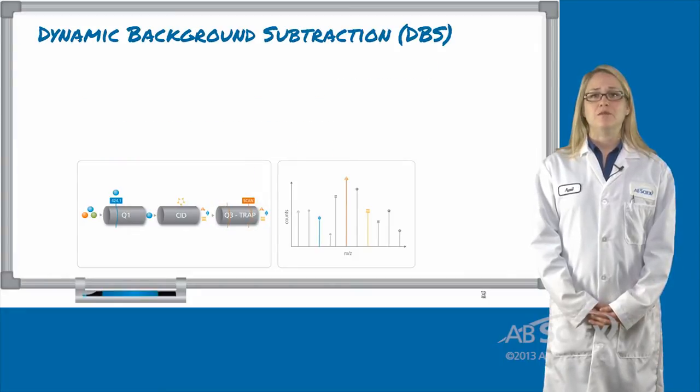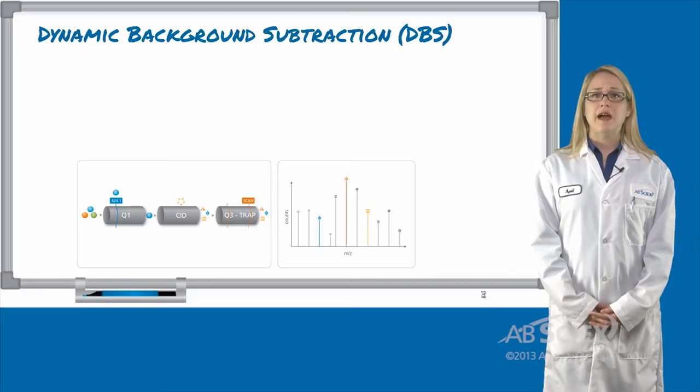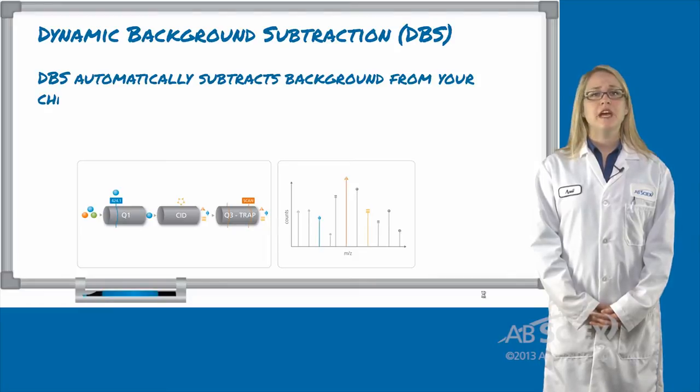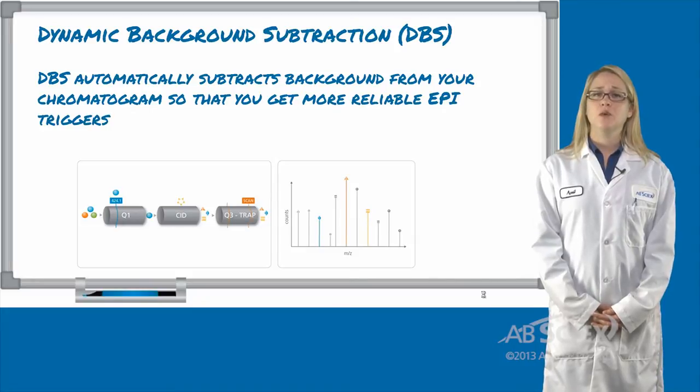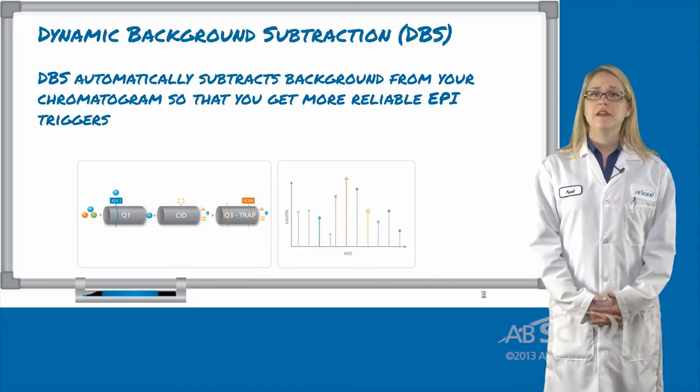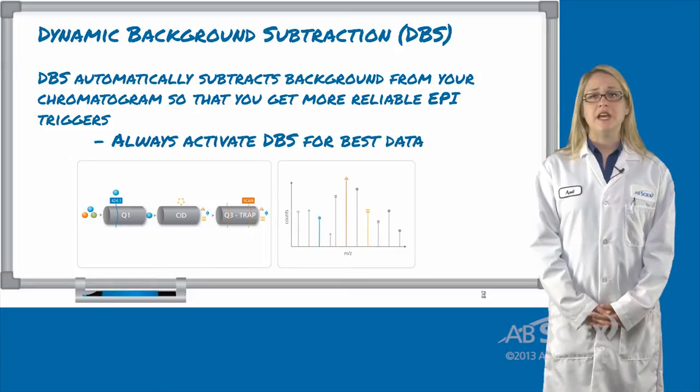Dynamic background subtraction, or DBS, automatically subtracts background from your chromatogram so you get more reliable EPI scans triggered, particularly when you have coeluting MRMs. DBS should always be activated to get the highest quality data.